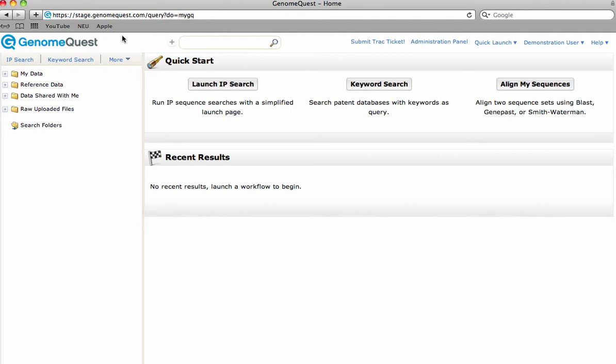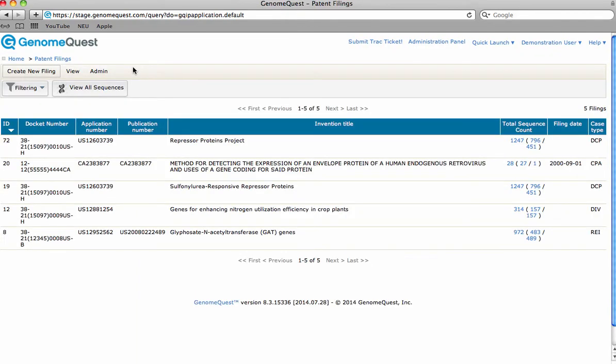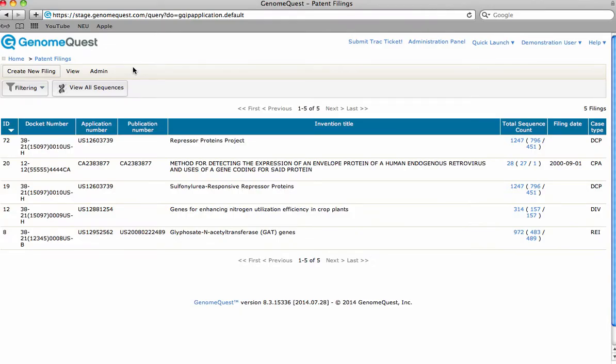Let's check out the system and major features. First, access our patent filings to view your projects. With the same familiar GenomeQuest view, you have the ability to search your IP sequences internally against corporate data and against GQPAT. To customize navigation, define columns through the View button, just like in GenomeQuest.